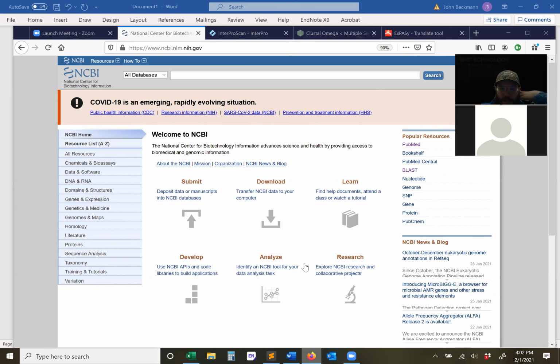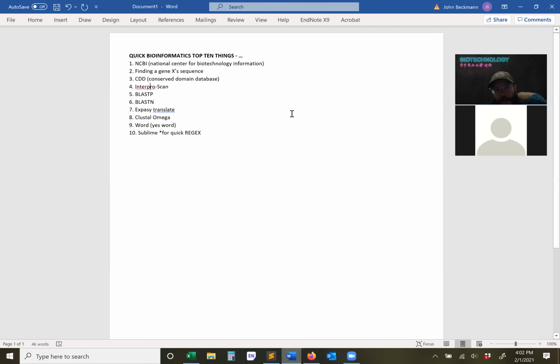So here we go. The gist of this is, this was a request lecture or a request lab that I could quickly go over, maybe the top 10 things that I'm doing most commonly in bioinformatics. These are all really, really easy things that you guys can do. They don't require any computer coding. They just require a moderate understanding of the central dogma of biology.